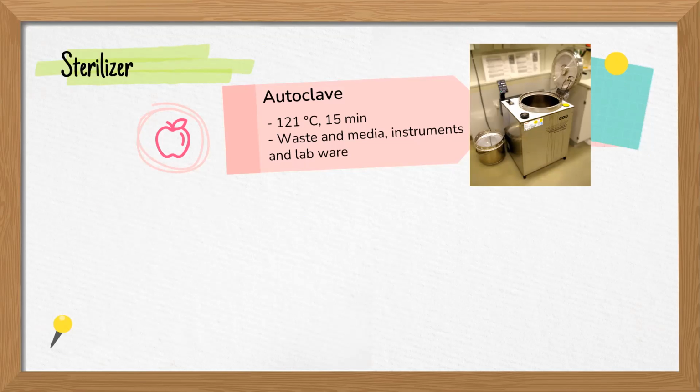This sterilizer is commonly used to sterilize surgical instruments, agar media, petri dishes, test tubes, as well as to keep all the medical equipment free of microorganisms. The appearance of the machine is a rectangular or cylindrical metal container with a strong lid. Inside, there is a chamber for packing items that need to be sterilized in the same manner as steaming. There is a space at the bottom of the chamber for filling the water.